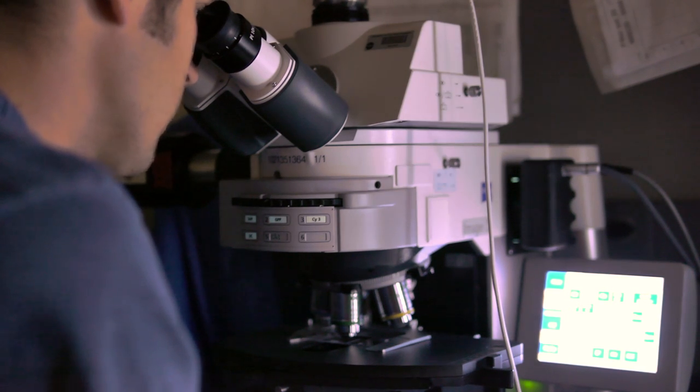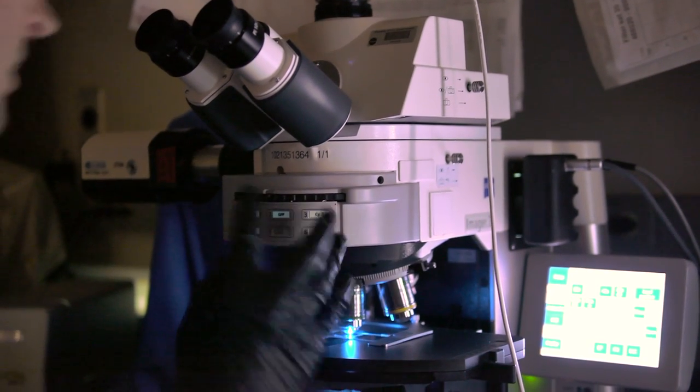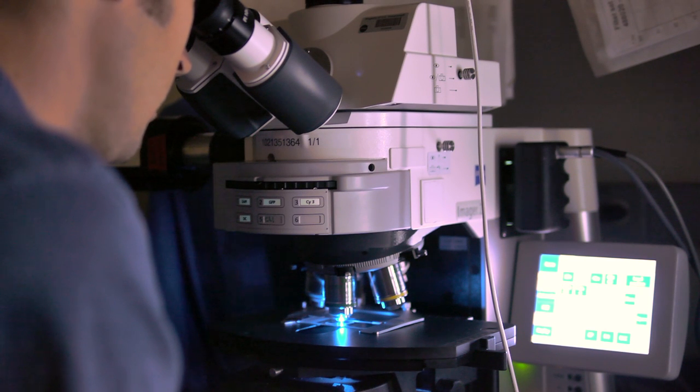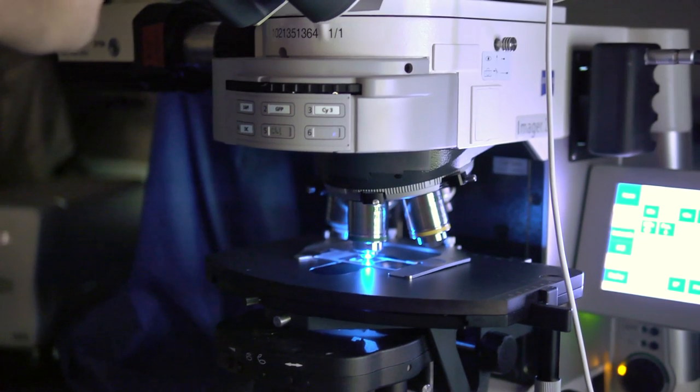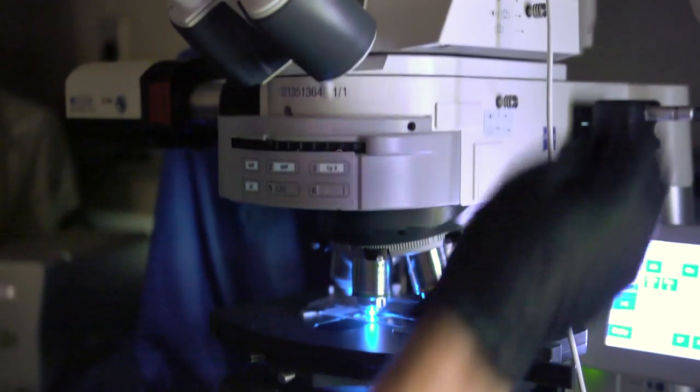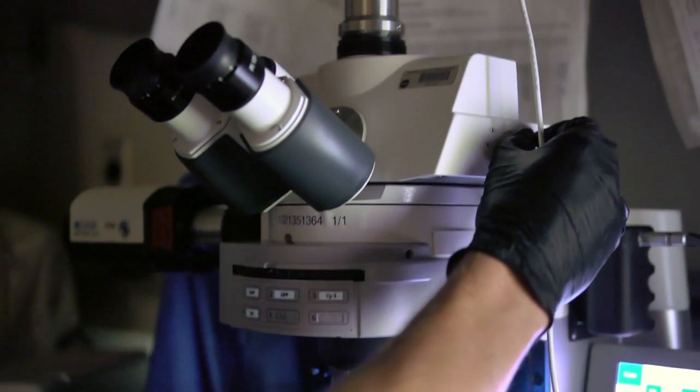And nothing's showing up there. I'm going to switch over to chlorophyll. And of course, since these are photosynthetic organisms, they will show up nice and brightly under the chlorophyll filter. And I'll try to get that on the video for you here. Put some on the camera and the video again there. Okay, great. So that's still calibrated about the same. The weird thing is the focus is a little bit different on the camera than it is on the microscope itself. So trying to get a clear, there we go. There's a clearer picture on the screen.